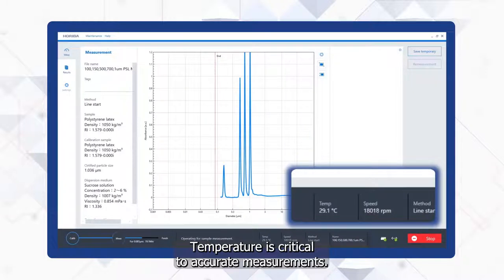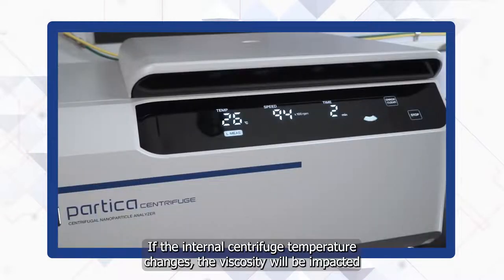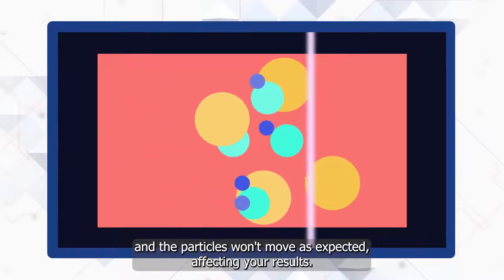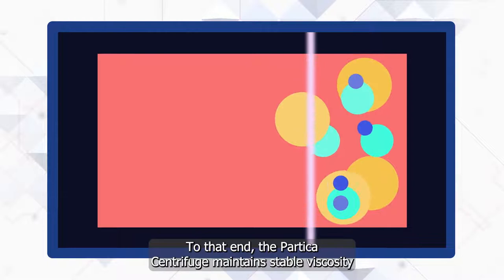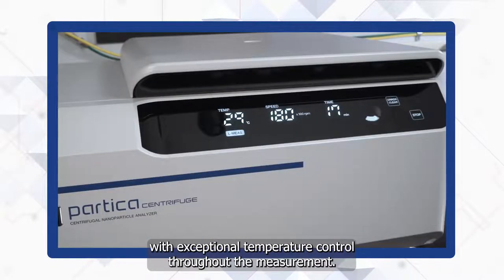Temperature is critical to accurate measurements. If the internal centrifuge temperature changes, the viscosity will be impacted and the particles won't move as expected, affecting your results. To that end, the Partica Centrifuge maintains stable viscosity with exceptional temperature control throughout the measurement.